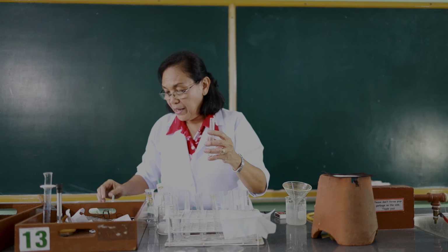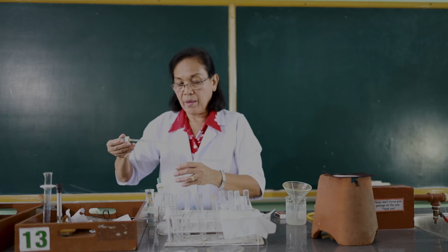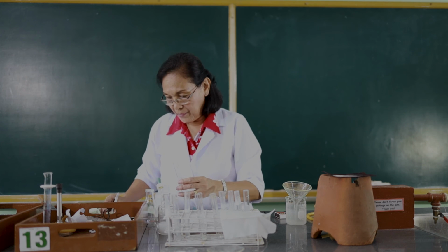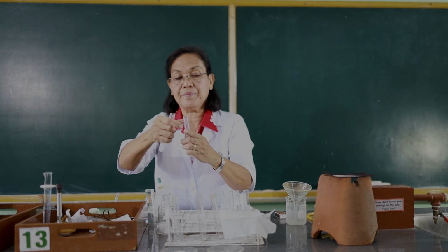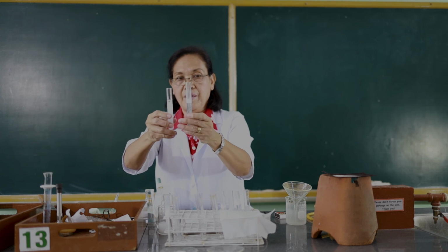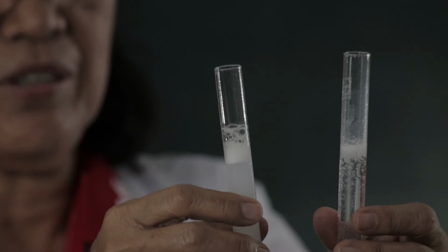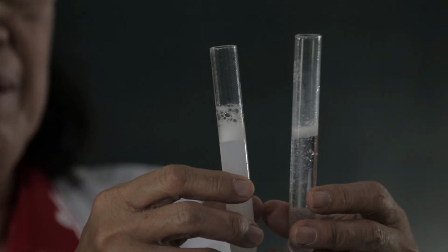And to the other one, I'm going to add the detergent. One, two, three, four, five, six, seven, eight, nine, ten. Take note. To this test tube, I added the soap solution. And to this test tube, which contains also the calcium chloride solution, I added the detergent solution. Compare the results.